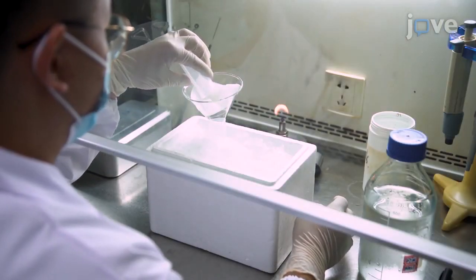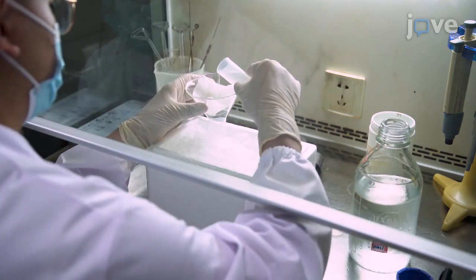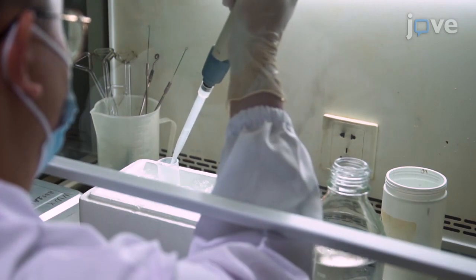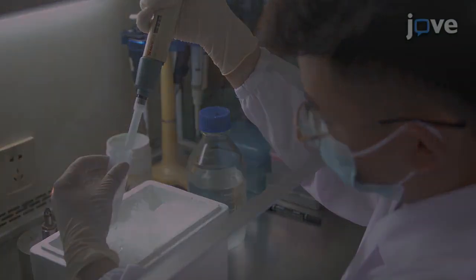Wash the lysed hyphae with 50 milliliters of 0.7 molar sodium chloride solution. Centrifuge the sample and discard the supernatant carefully. Resuspend the protoplasts in 20 milliliters of 0.7 molar sodium chloride solution.